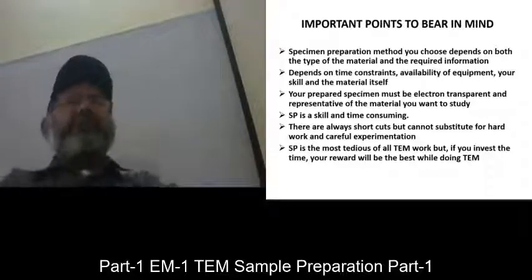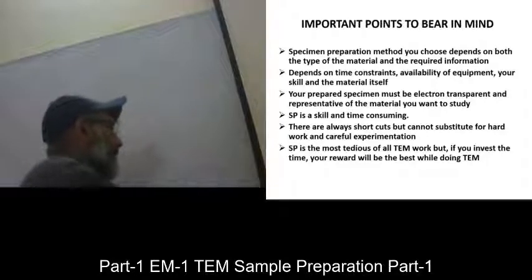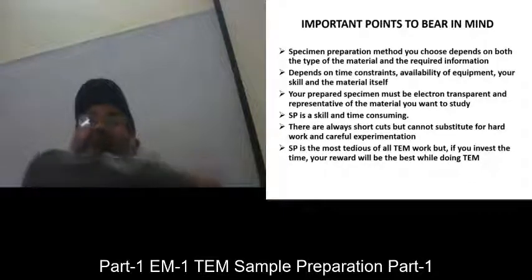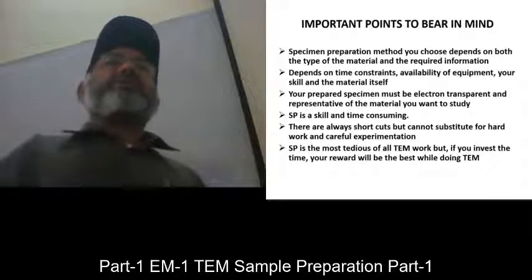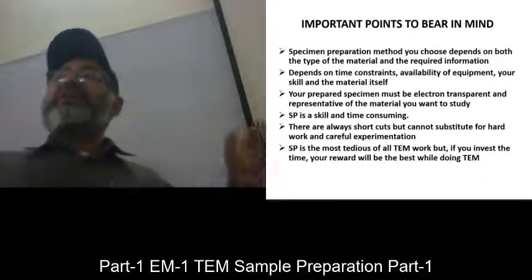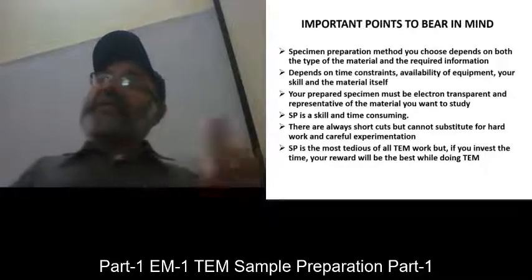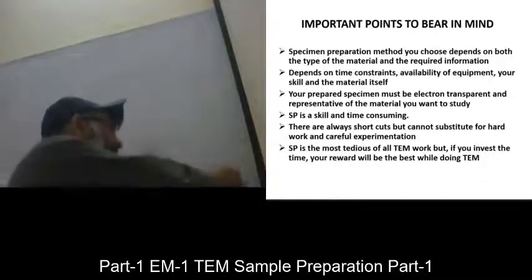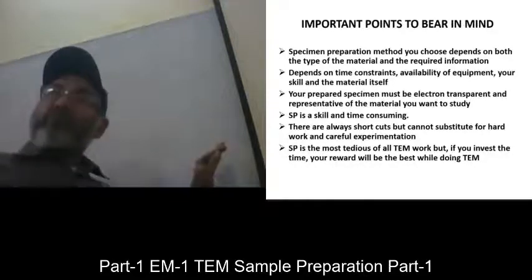And if you are doing chemical analysis of a sample, and if I tell you that, for example, this is the sample, and you are doing chemical analysis of this crystal, then however much you isolate it, it is covered by the glass. So when you are taking the EDS spectrum, energy dispersive spectrometry, of this material, then you are getting information from both the crystal as well as the glass. And that overlapping, superimposing of peaks confuses the result you get. And for that purpose, if you thin it down so that no overlapping glass is left, then that will be a little bit more useful information.